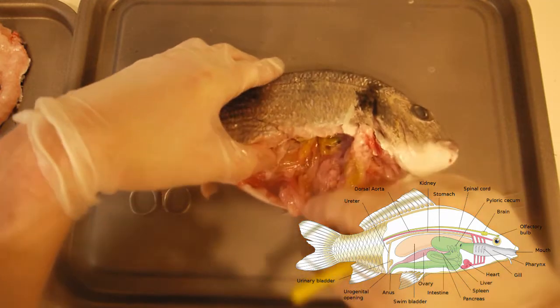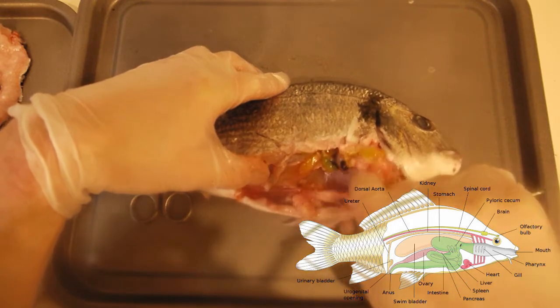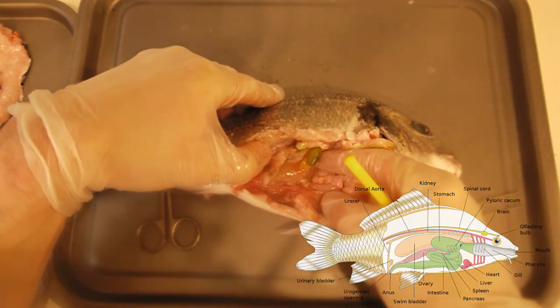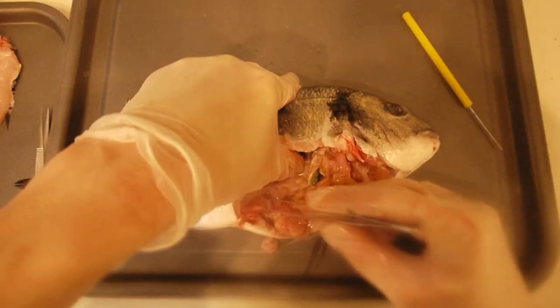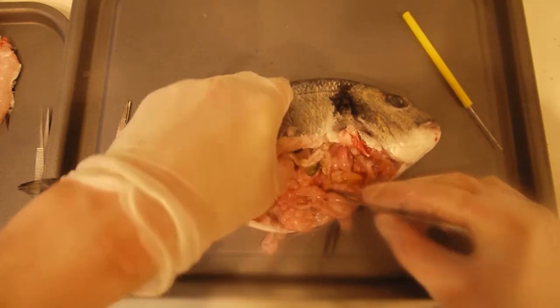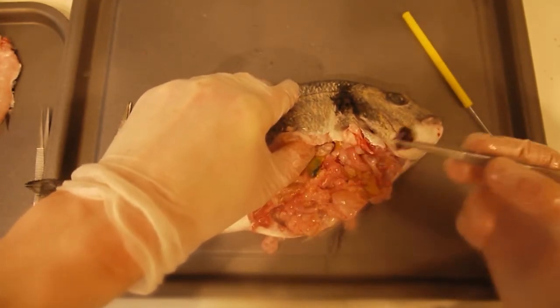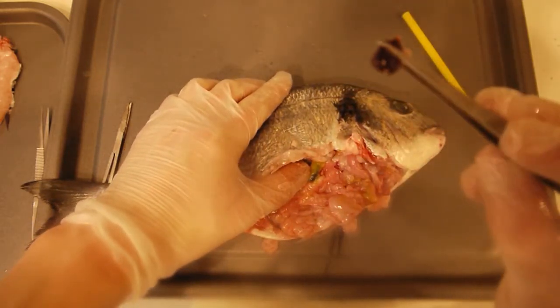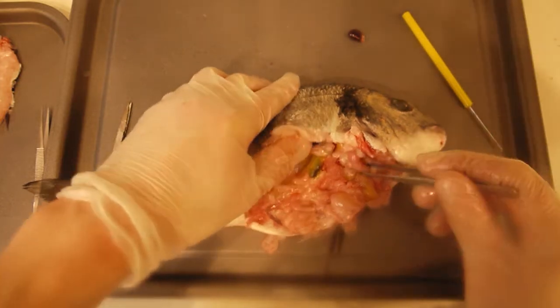Let's take all of this out very carefully. And that's the gallbladder there — this little green bag. That is the spleen. I know it's the spleen because it's very dark red and brown, and that's because it's full of red blood cells. Let's put that aside.